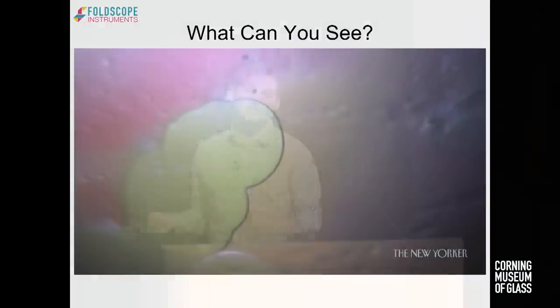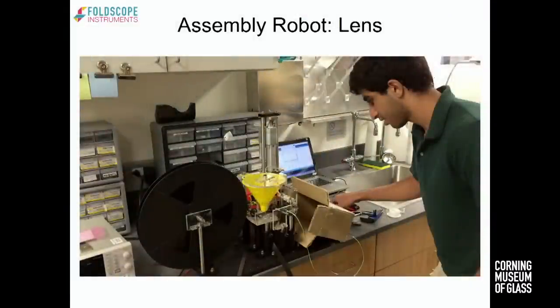So that's just beyond some of Manu's great poetry there. You can see just some of the amazing things you can see under the Foldscope. It's really amazing. If you spend an afternoon asking, what are all the things I can look at under this instrument? I've lost many days that way. They are not lost days, I should say.